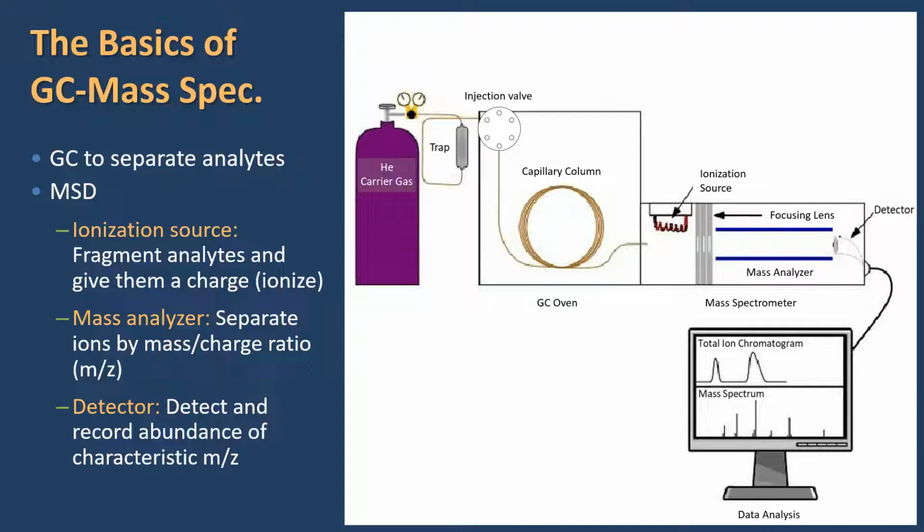But we're going to collect all of those mass fragments and propel them with electromagnets towards our detector element. Our detector element is simply an electron multiplier. That's a device that has a very high voltage applied to it. It's just waiting for a little bit of kinetic energy to avalanche electrons and cause enough current that could be picked up by our data analysis system. So we're generating fragments, we're shooting them towards the detector.